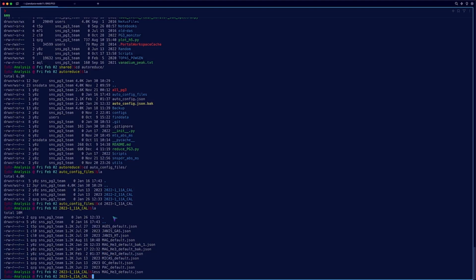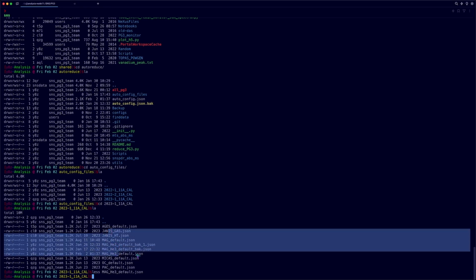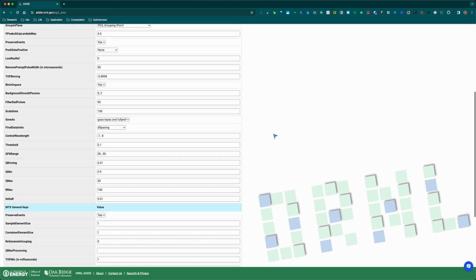And for sure, we can go to the analysis cluster using either SSH, like what I'm doing now, to make some edits to the files. Or you can go to the web browser using Symlink, whatever way. But anyhow, that involves some connection and some manual effort to make changes to those files, which have control over the auto reduction pipeline. But actually, we can put it into a dedicated place on the web, which is very easy to access and very error-proof. That's how this web page is going to be helpful.